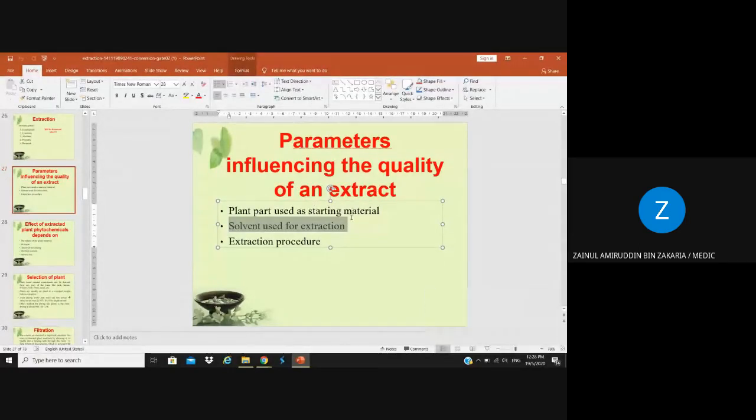Understand? So what you need to do is isolate using a non-water-soluble extraction. For example, if you are afraid to use chloroform because chloroform is toxic, or petroleum ether, any organic solvent that is non-polar is highly toxic.